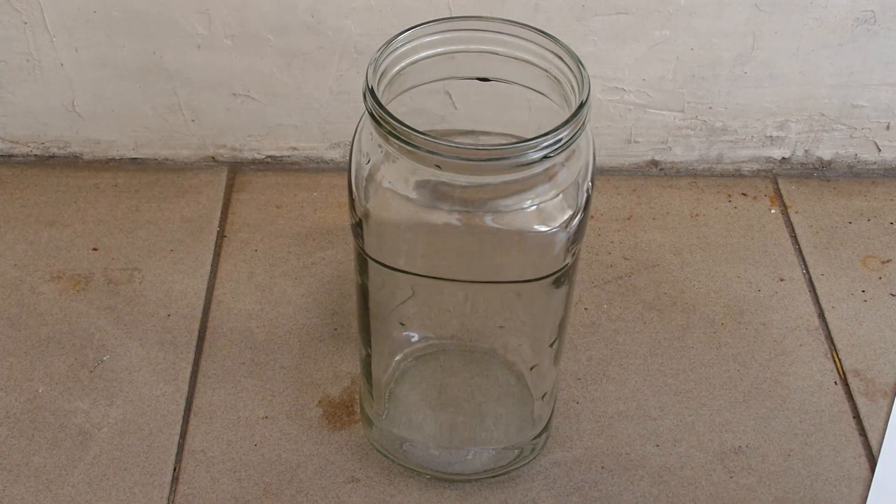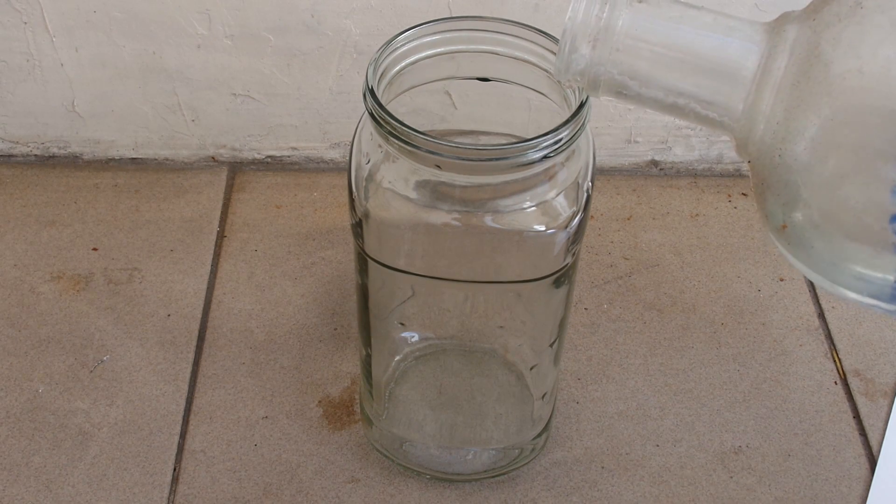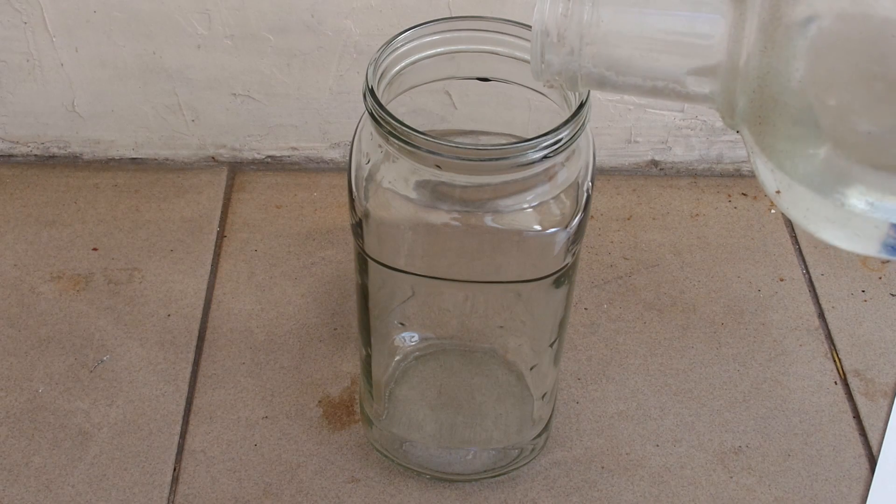Because nitric acid is hard to get and expensive, I will use an excess of concentrated sulfuric acid and a nitrate salt solution.